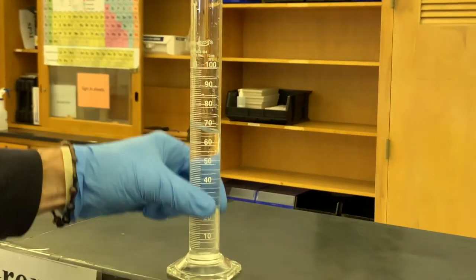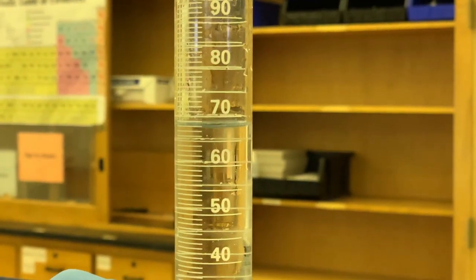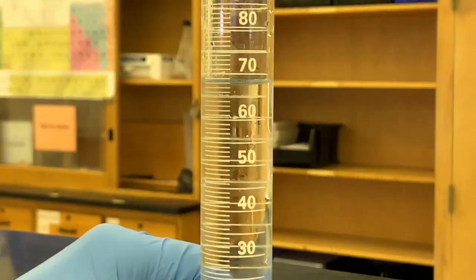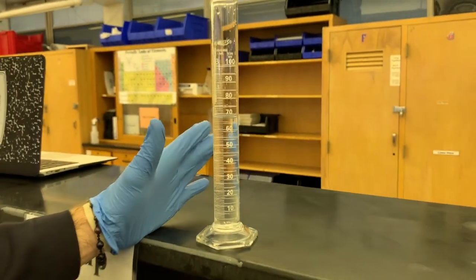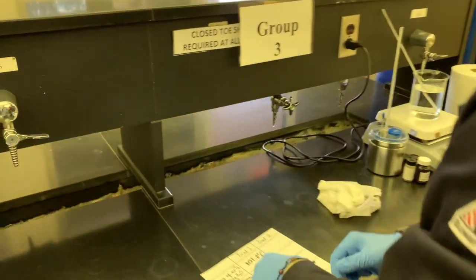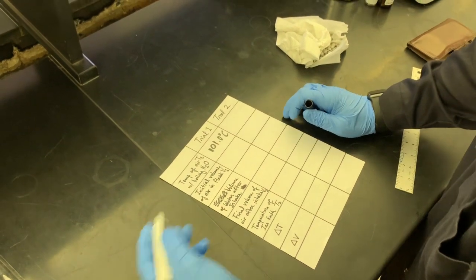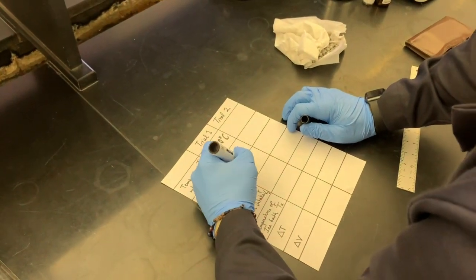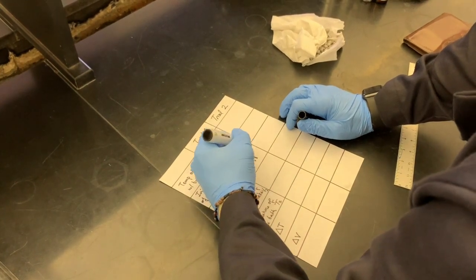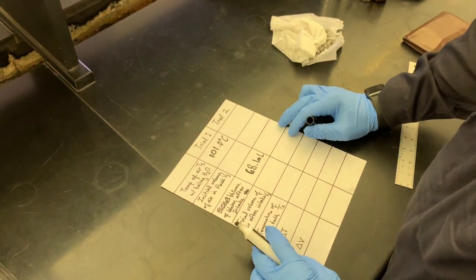Depending on how much water may or may not have gotten in accidentally, what we ended up with was about 68 milliliters. I would say 68 exactly, maybe 68.1. We're gonna write that down on a results sheet. So, the volume of water after intake is 68.1 milliliters.